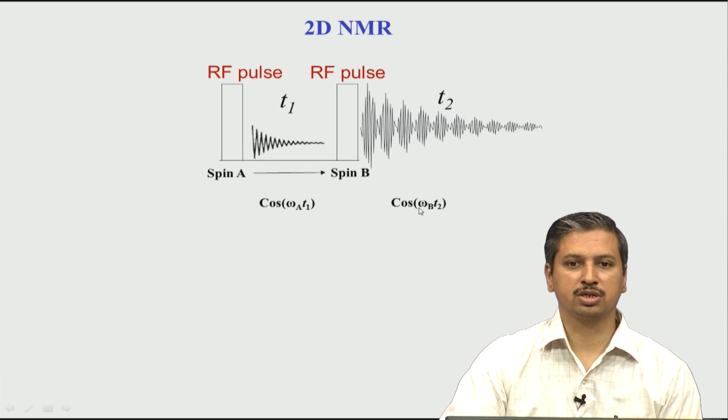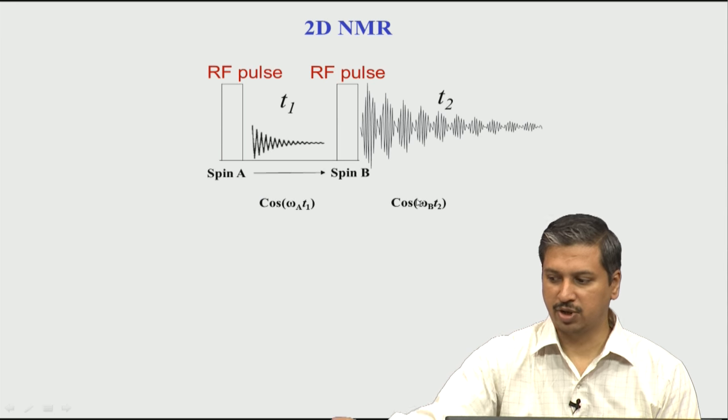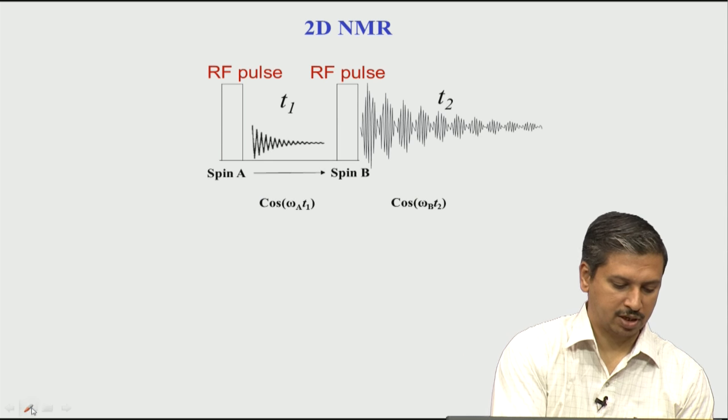Okay. So, this is now captured as a FID physically. This is what is detected physically, but this is not detected physically. Now if you see here, my final FID will be a multiplication of this multiplied by this. Okay. So, let me write it mathematically here.